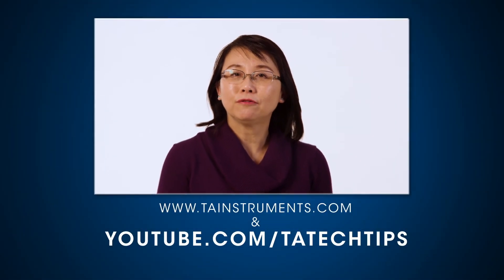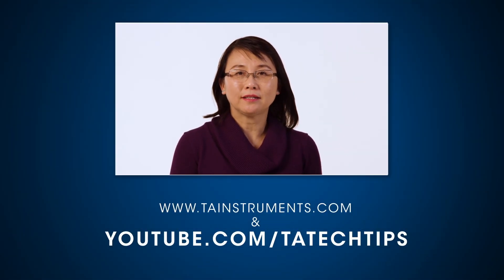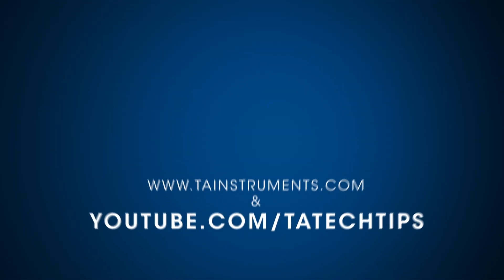In this TA Tech Tip, we have demonstrated how to install and calibrate a dual cantilever clamp on a DMA 850. Please stay tuned for more TA Tech Tips and thank you for your interest.